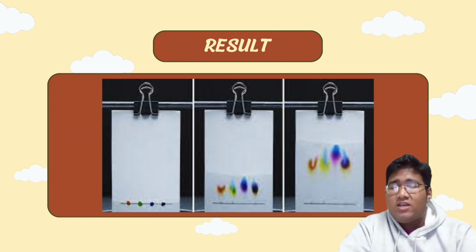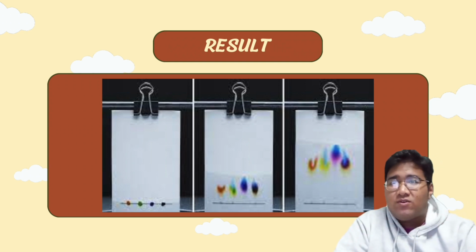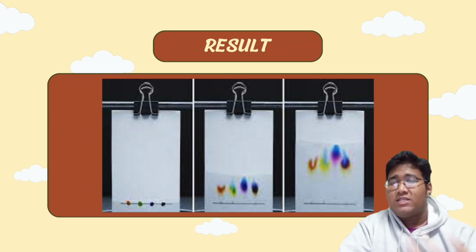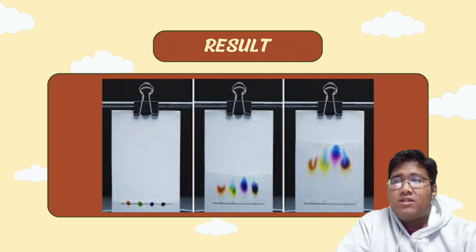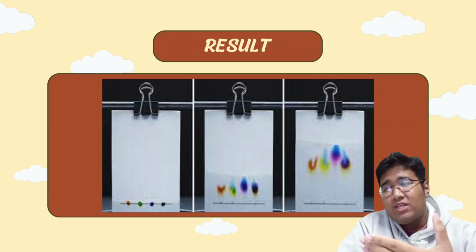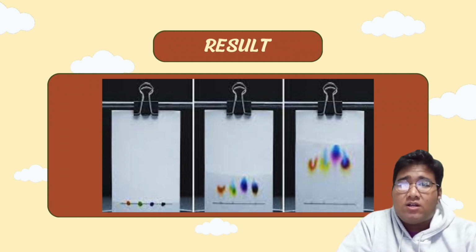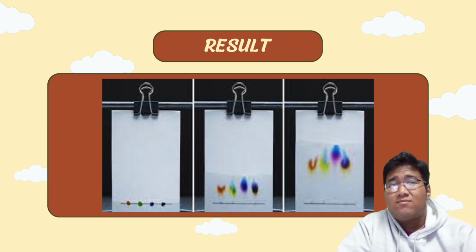The green will expand into cyan, green, and yellow. The dark blue will expand into blue, dark blue, and purple. Meanwhile, the black ink will expand into various colors: you can see cyan, dark blue, and yellow, even though it is from black.